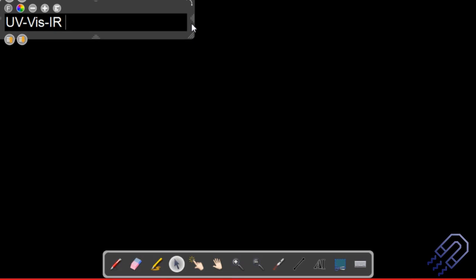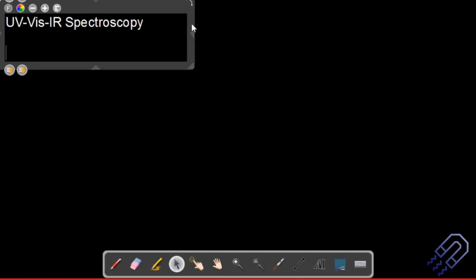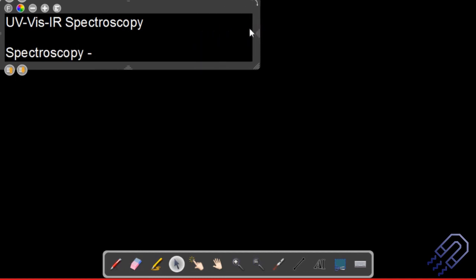In any device, it's coupled with UV-visible spectroscopy, and basically will have a range of near infrared. So these three techniques might come together. The basic understanding of these three techniques is the same: how the instrumentation is, how it works, and so on remains the same, without much of a difference. If one understands one, the other should be more or less easy. What kind of lamp will actually generate an IR signal, a visible signal, or a UV signal is something I'd like to explain in this particular section.